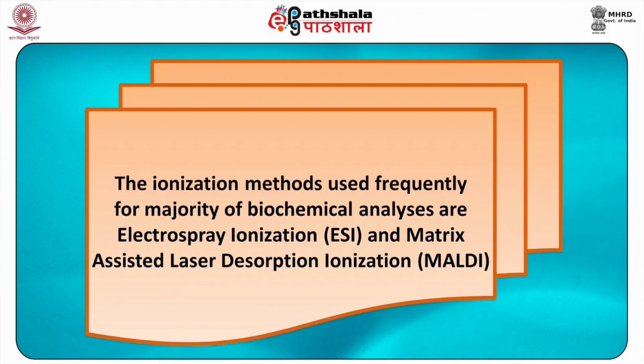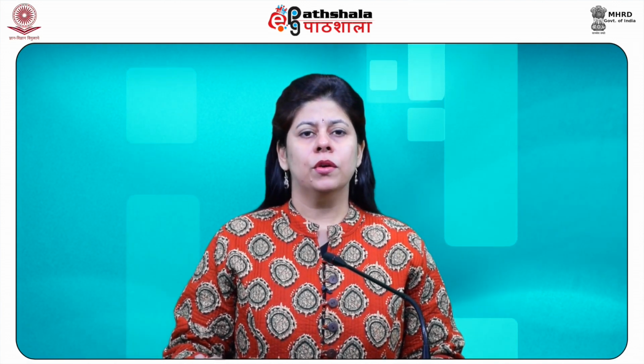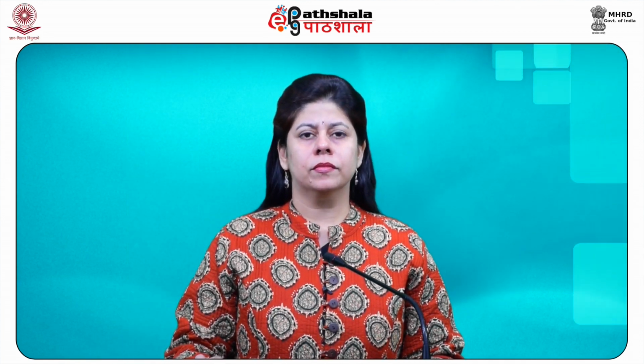The ionization methods used frequently for the majority of biochemical analysis are electrospray ionization and matrix assisted laser desorption ionization. Both negatively as well as positively charged sample ions can be created using most of the ionization methods.